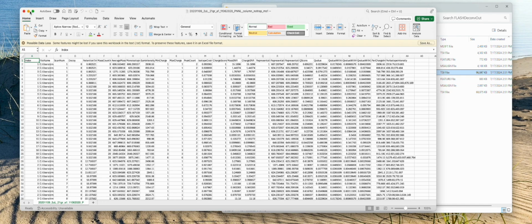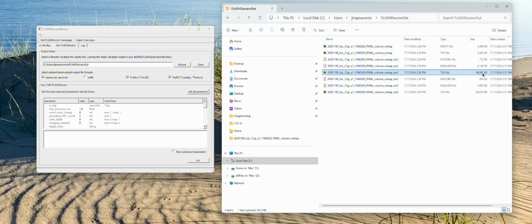And even though this file, the TSV file, is quite a bit larger than the MS Align, like I said, my program runs much faster with tab separated file because it's already in a structure that plays nice with making data frames.